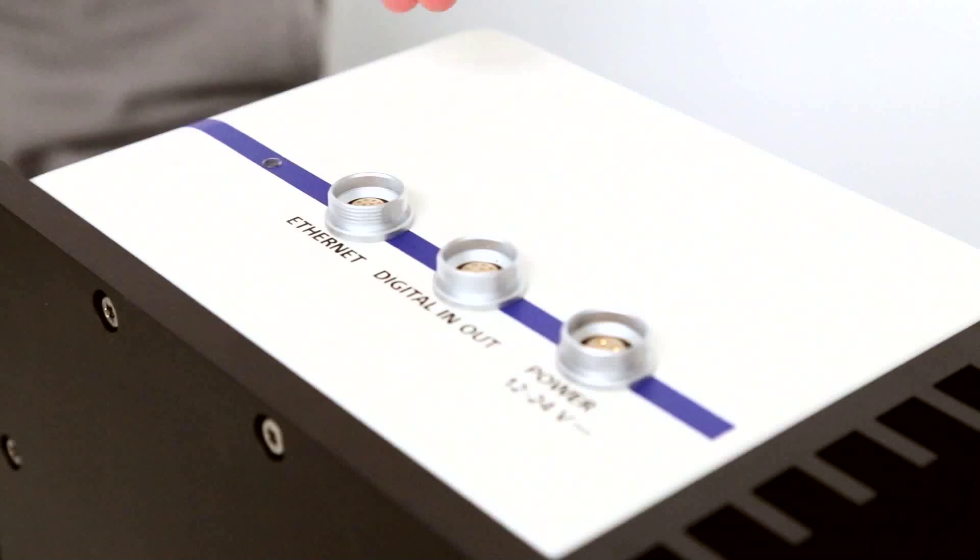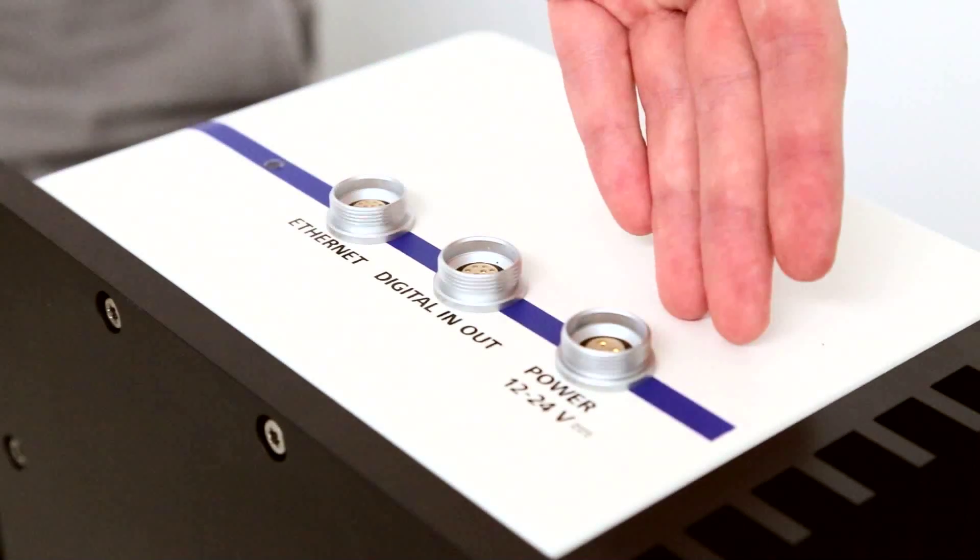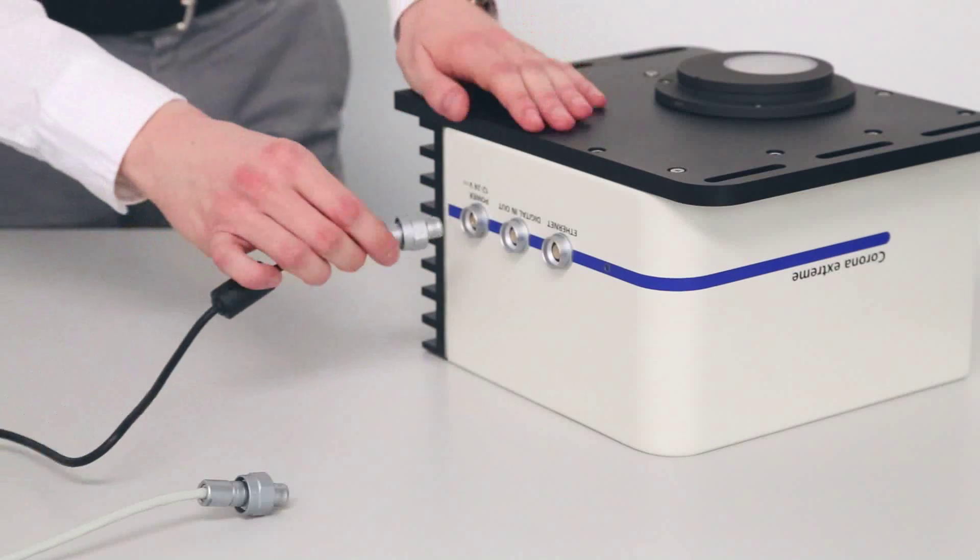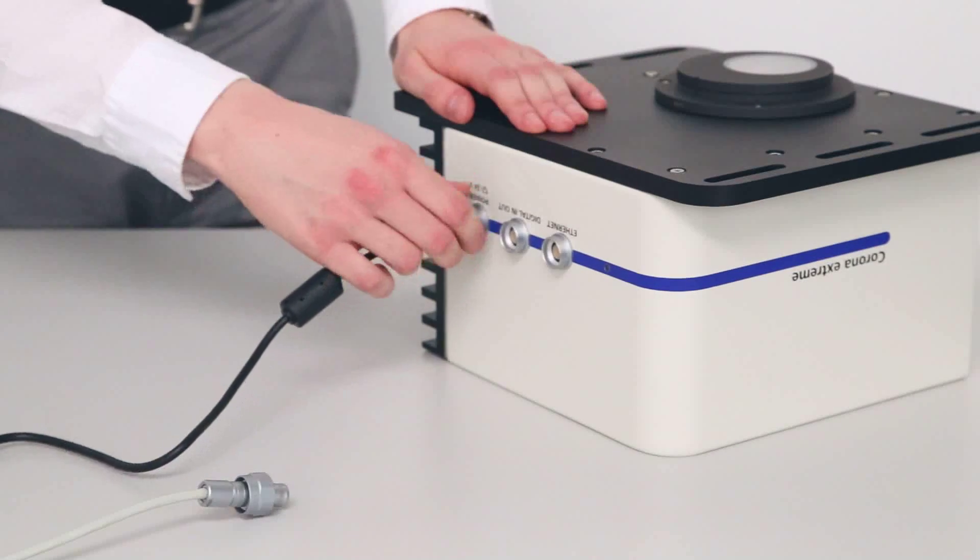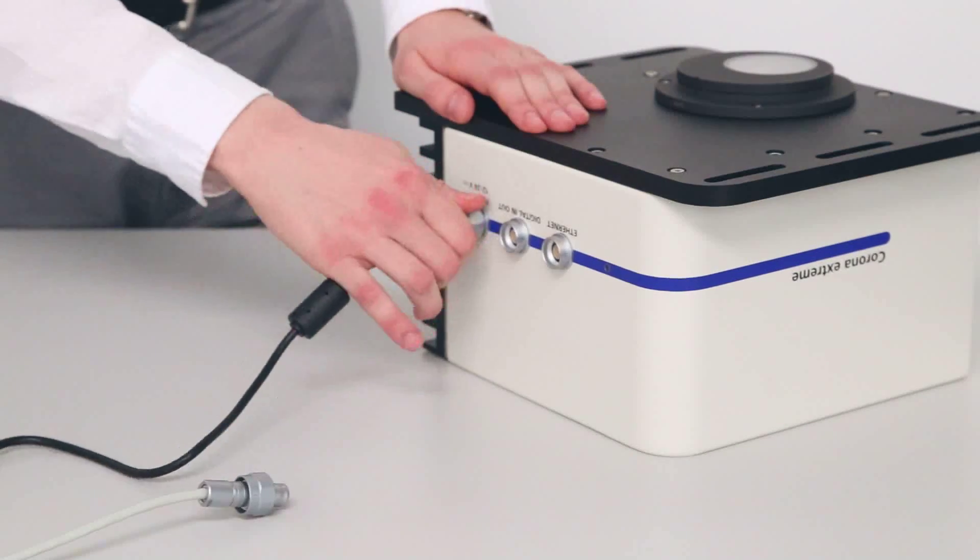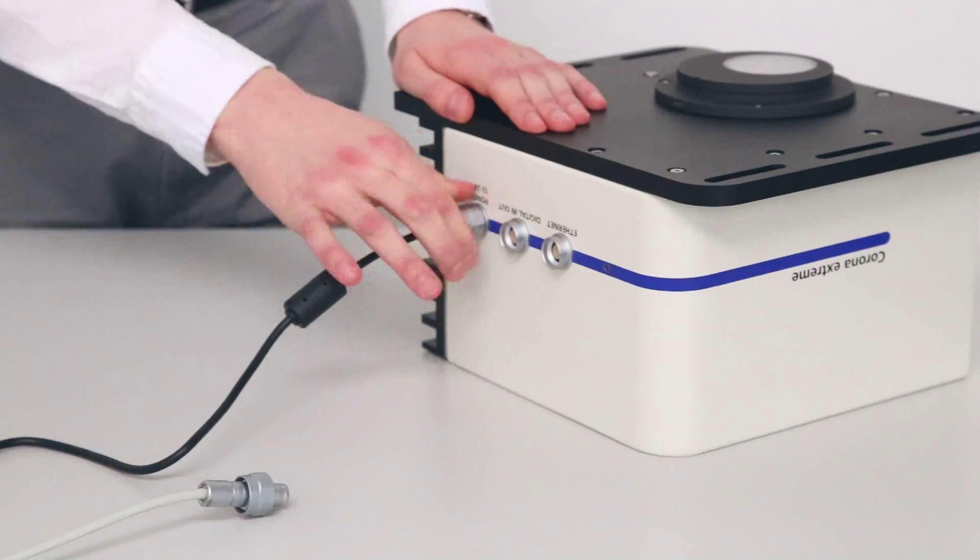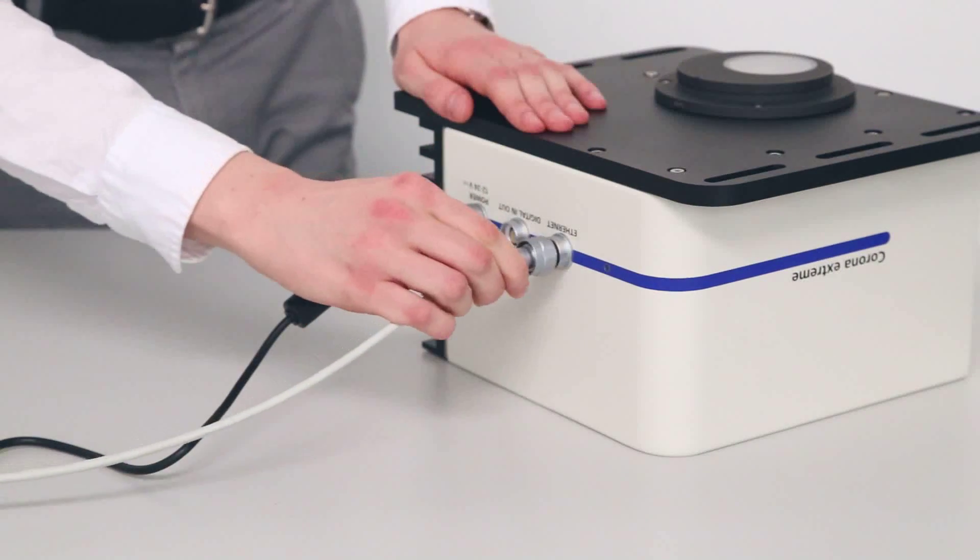The Corona Xtreme features three connectors for Ethernet, digital in and out, and the power supply. First you have to connect the power and then you can plug in the Ethernet connector.